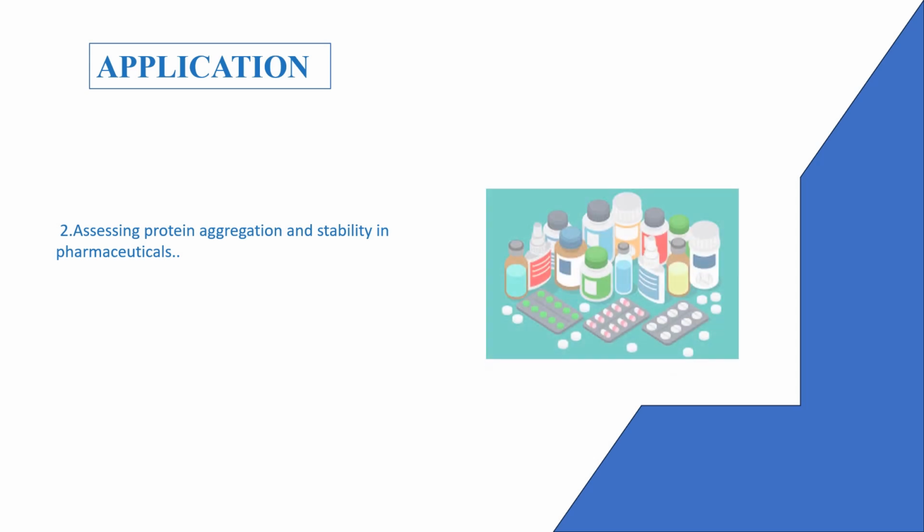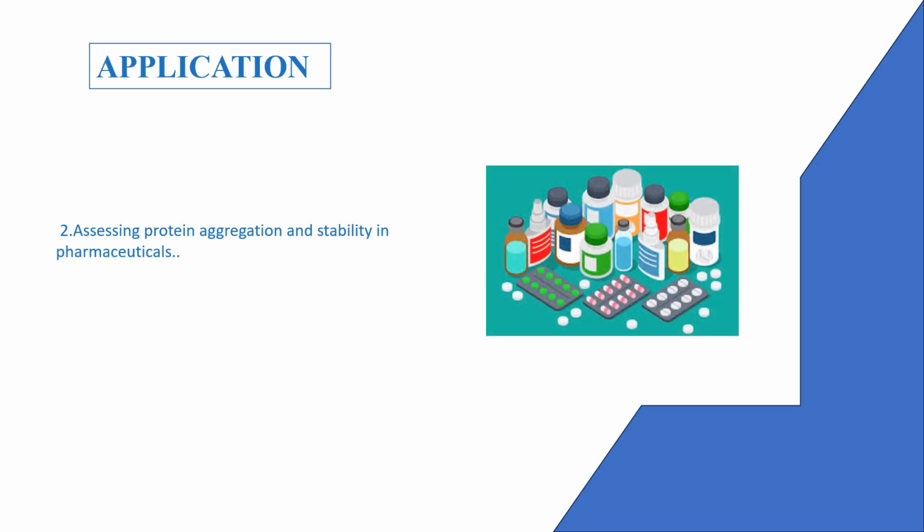The second application is assessing protein aggregation and stability in pharmaceuticals. Aggregation can affect the stability and efficacy of protein-based drugs, potentially leading to reduced activity or immunogenic reactions in patients. By detecting even small aggregates, DLS ensures formulation stability and helps in developing safer biopharmaceutical products.